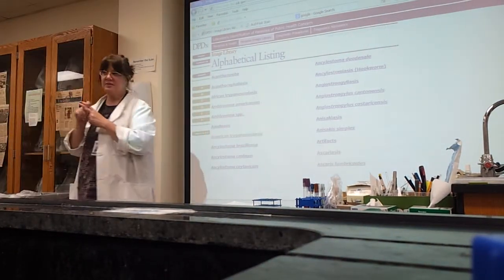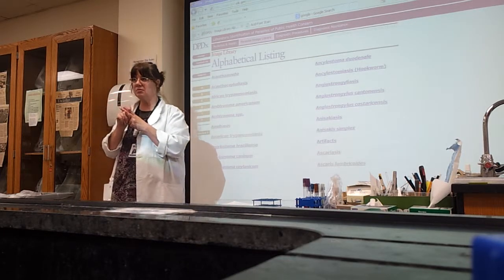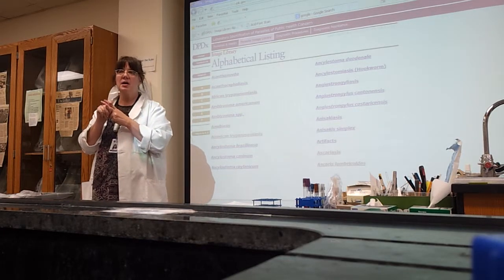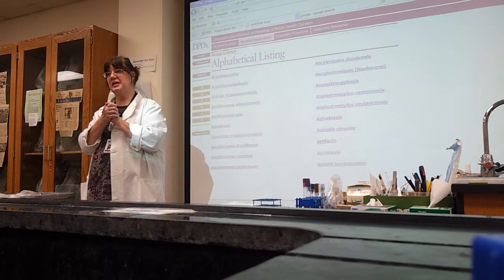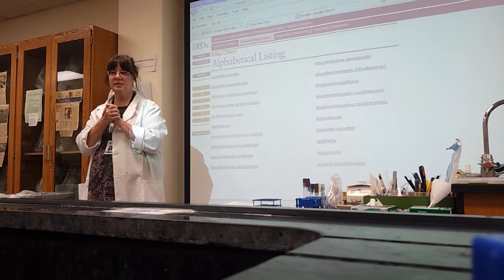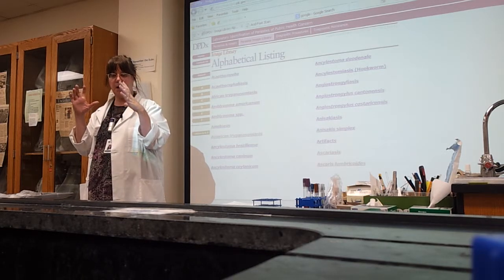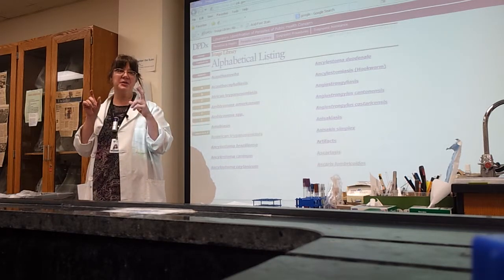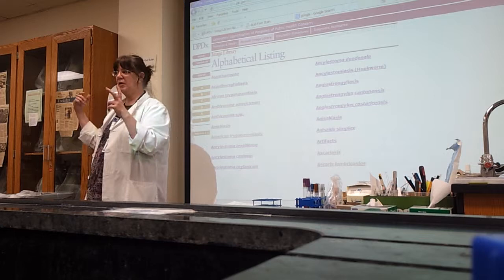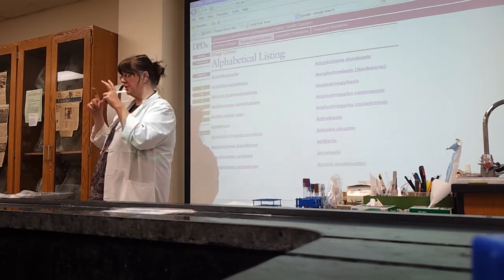Here's a tripping stone. Is it Balantidium or Balantium? Balantidium. As long as you get close, you're okay. He's a big ball. He has a bar, or like a bent bar in the center. A lot of people mistake him for a worm egg. He's not a worm egg. He's a ciliate parasitic protozoa.